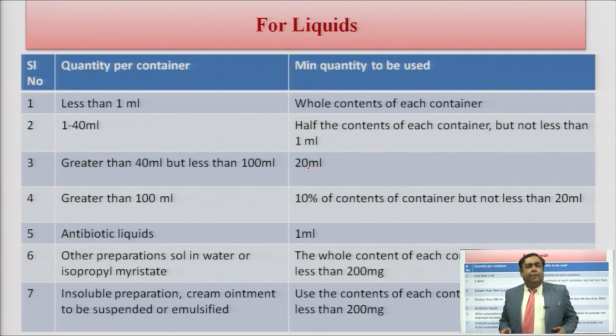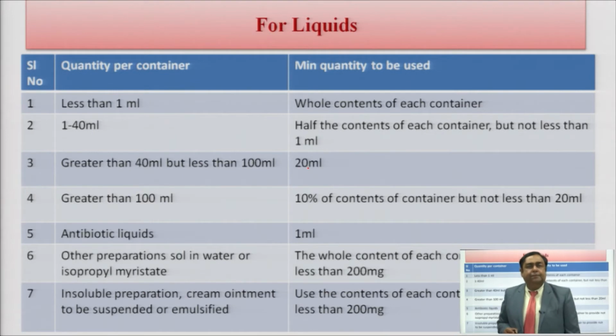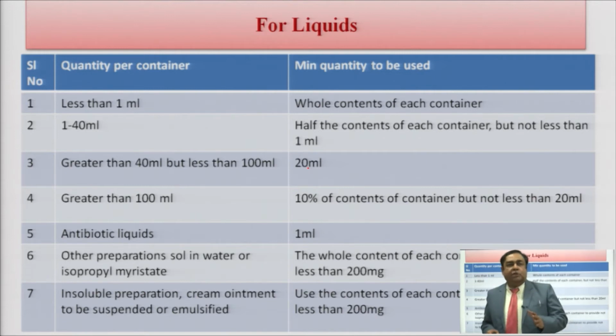Apart from antibiotic solutions, for all other preparations which are soluble in water or in isopropyl myristate, you need to take the whole content of each container, but the quantity should not be less than 200 milligram; that minimum quantity must be present.